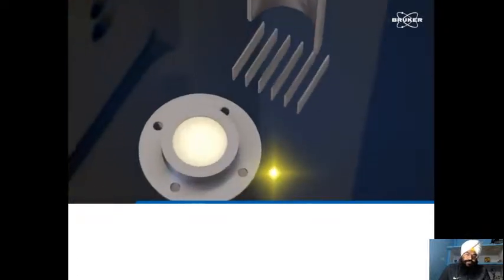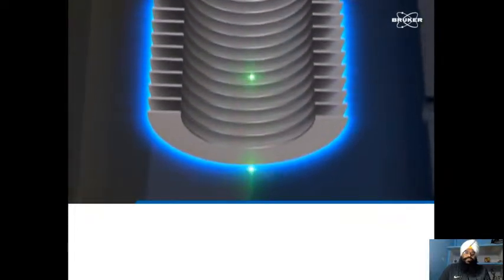Based on the expected time of flight of the precursor ions, specific ion packages may be individually selected, and all other ions blocked from continuing through the flight tube. The selected ions are then re-accelerated, with the precursor and fragment ions traveling at different speeds towards the reflector detector. The ions travel via the reflector towards the detector, and thus a TOF/TOF spectrum is recorded. The detection of the selected precursor ion and its fragments creates a TOF/TOF spectrum. Whether fragmentation occurs through the use of higher laser energies or a collision gas, the structural details derived from the MALDI TOF/TOF spectrum provide a deeper analytical insight into the targeted compound.